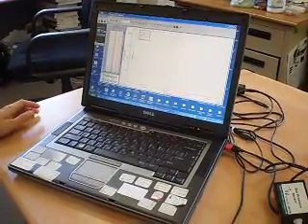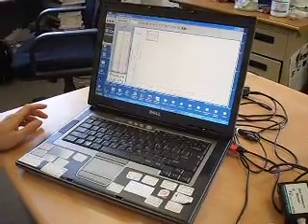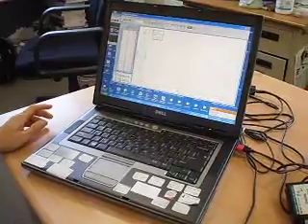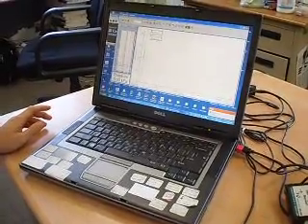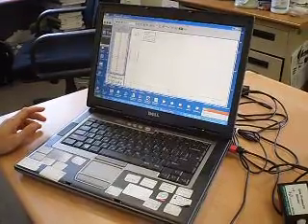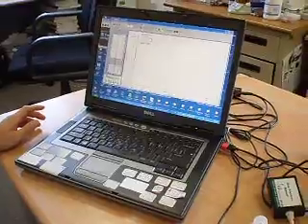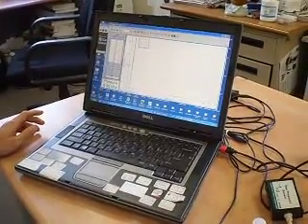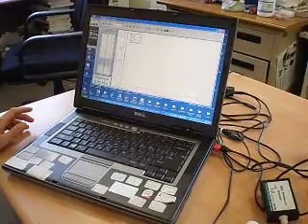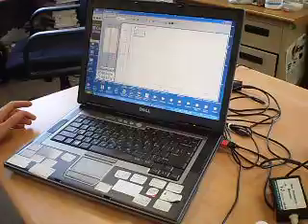I'm going to measure the pressure change for the first 10 seconds. I'm going to highlight time 30. For the first 10 seconds, that will be 40. That will be from 30. I'm going to take it as 38.